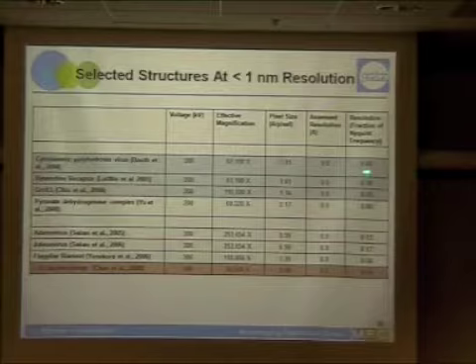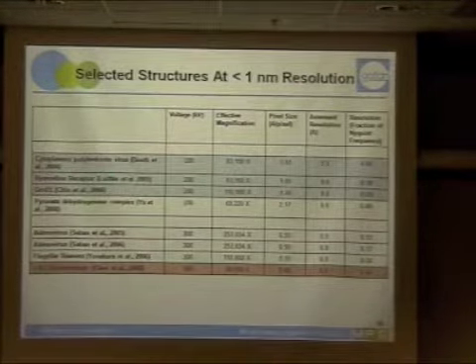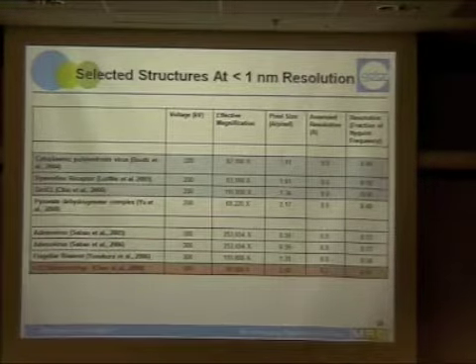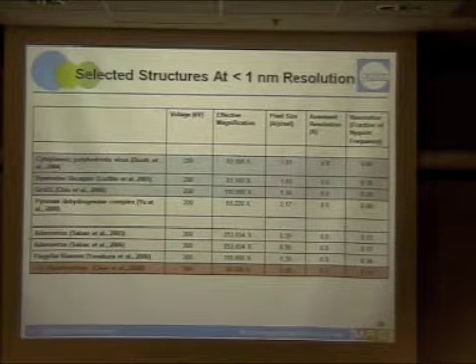And this one here is the first one we did. The one I talked about previously is CCD camera A. So we were about 2/5 Nyquist frequency. And so, despite the fact we went up to 300 kilovolts, we were able to see an improvement in usable pixels.